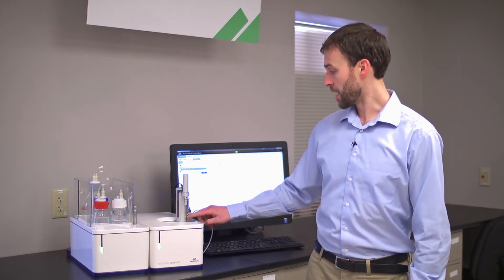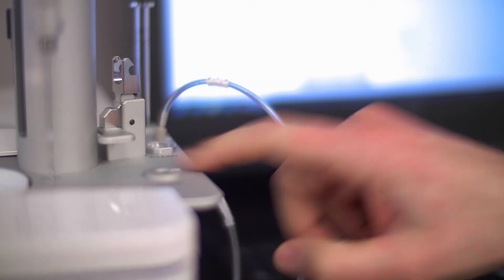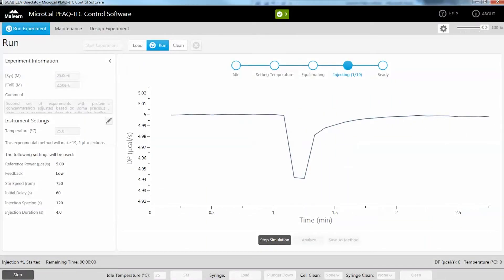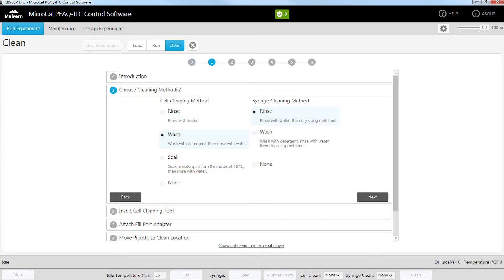There is also a latching mechanism to ensure a good seal during routine syringe cleaning and maintenance. The most noticeable change, however, is the all-new instrument control software and data analysis package. The instrument control software offers guided workflows with step-by-step help videos and maintenance alerts, making the MicroCal PEAQ ITC perfect for a multi-user environment and ideal for either novice or expert users.